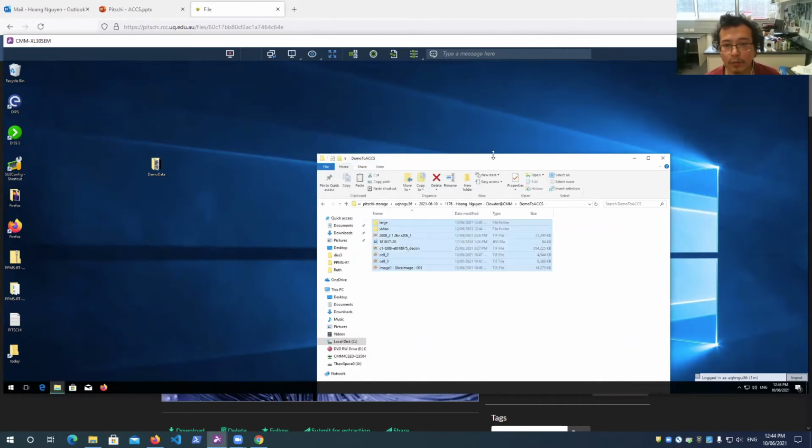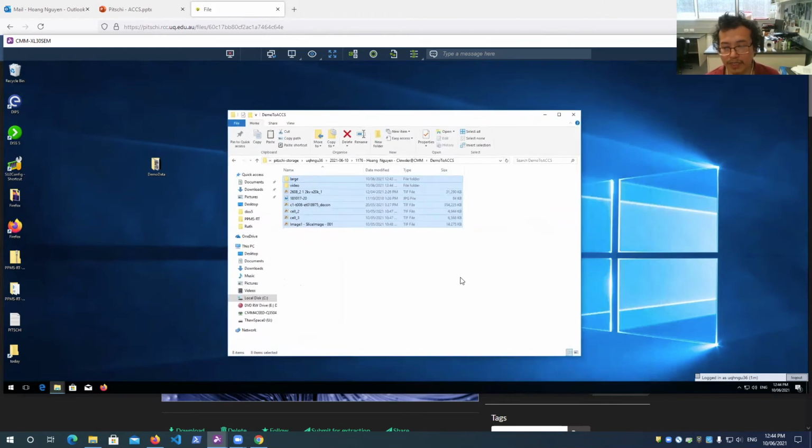What happens in the background is there is a process running in the background, so the user can still use the computer when this is happening. For this particular case, because this is a demo, it happens once every 5 minutes. But like I said, when we install on the instrument computer, we will tune it based on the instrument characteristics, like how much data it generates, that kind of thing.